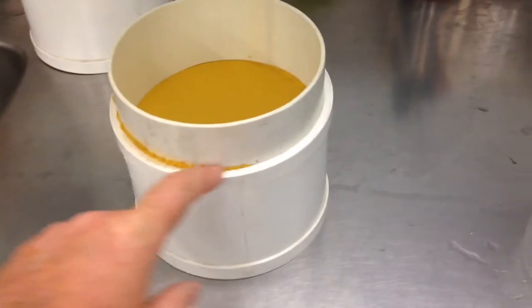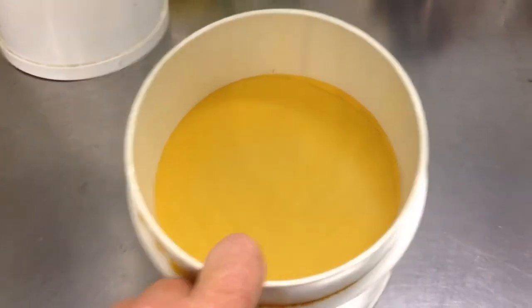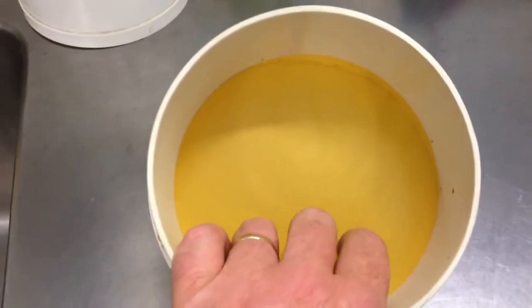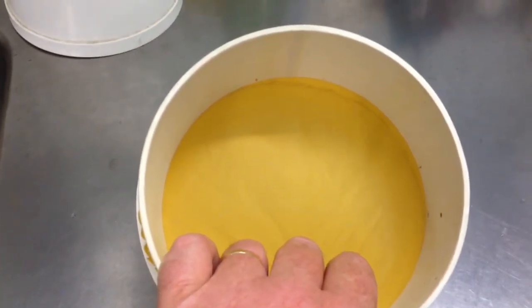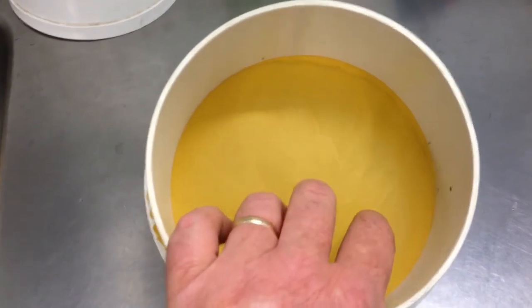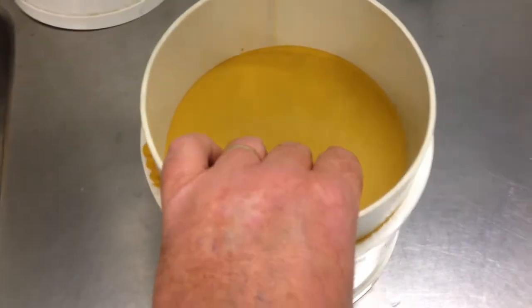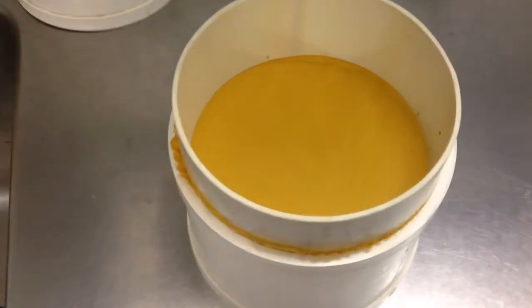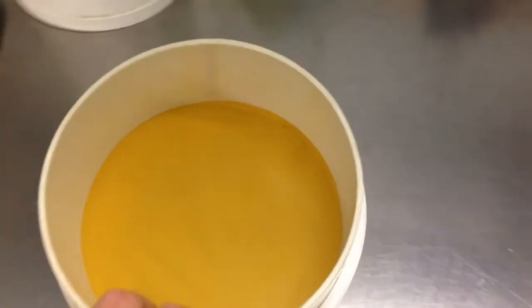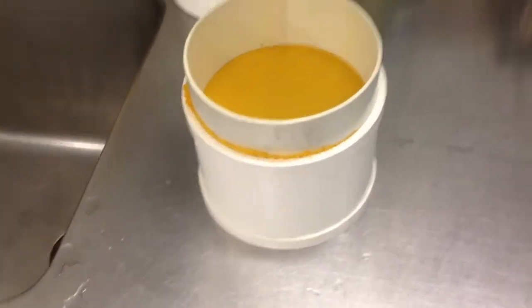Again, trim off any excess. With the 24 micron screen, make sure that you actually wet it before you use it, because you will find that if you just try and drop water or a paramecium culture straight on it, it won't filter as well as if it's already been saturated. So give it a spray with some pressurized RO water or something like that to wet the material first, and once that's done, you should find that it filters fairly easily.